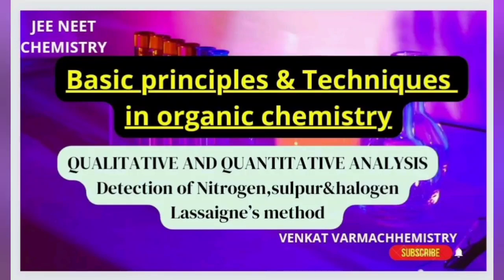In this session, I am going to discuss another episode of qualitative analysis. In the previous session, we learned about detection of carbon and hydrogen. In this session, I am going to explain detection of nitrogen, sulfur and halogen.